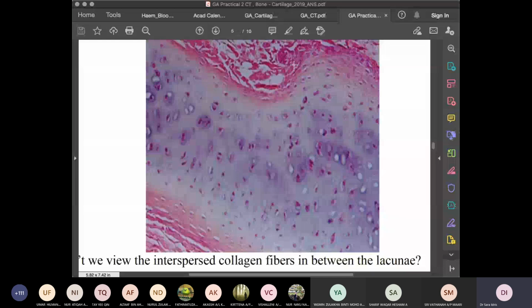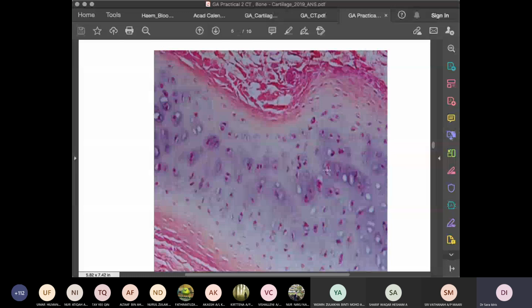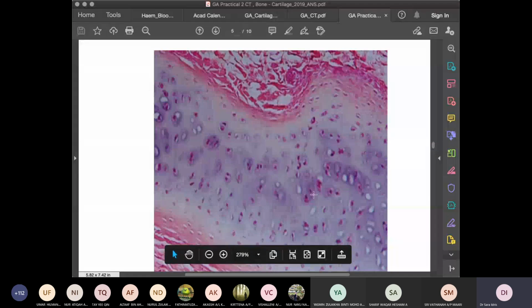Then when you go inside, you can see the chondrocytes are in lacunae. Chondrocytes are in their isogenous group, or you can call them nest cells, in your lacuna, stuck with another chondrocyte that's also in a lacuna. You have this because the cell goes through mitosis and you get the same type of cell. That's why they call it an isogenous group of cells. So these are all your chondrocytes in lacunae, in isogenous groups.